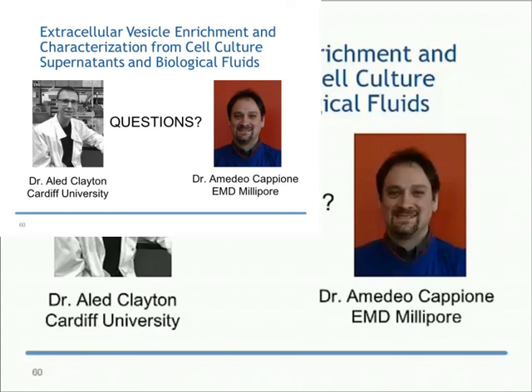We've had these problems daily in the lab and in the kind of work that we're doing, so we really scratched our heads about this. What we wanted is a really quick and easy single method to give us some kind of estimation of purity. So with the advent of the nanoparticle tracking technology from NanoSight, we do a particle measurement, and then we also measure protein by a colorimetric assay. And then we relate the two numbers together, so we get a particle-to-protein ratio.